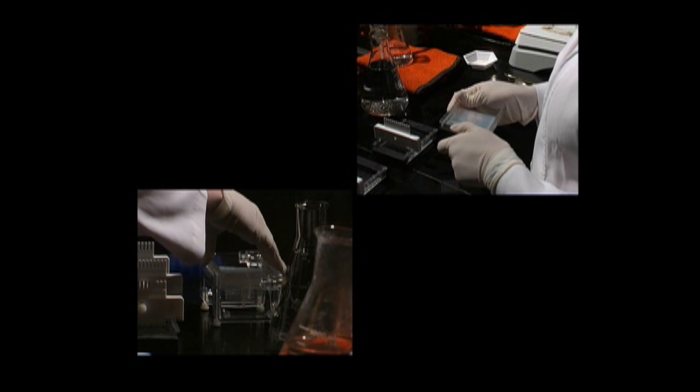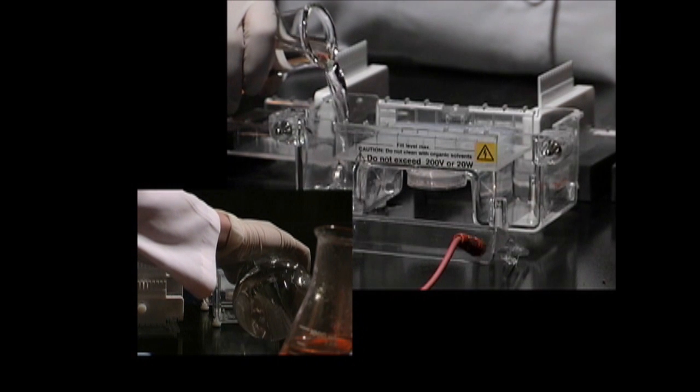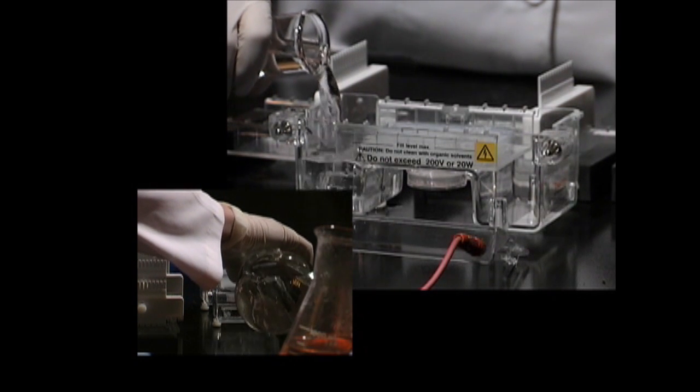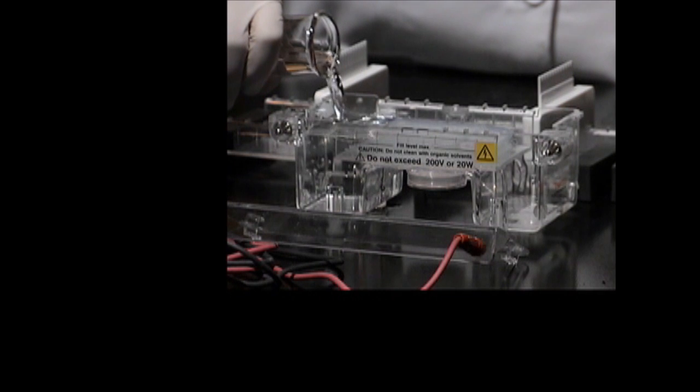Place the gel bed into the electrophoresis chamber, centered and level on the platform. Fill the chamber with diluted buffer. This type of gel is often called a submarine gel, because it's submerged under a buffer.